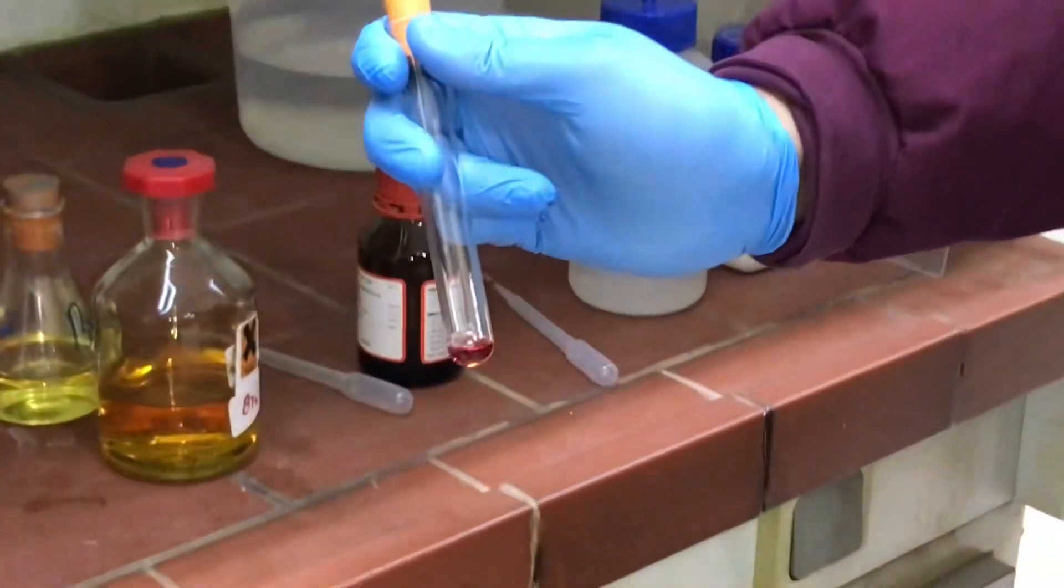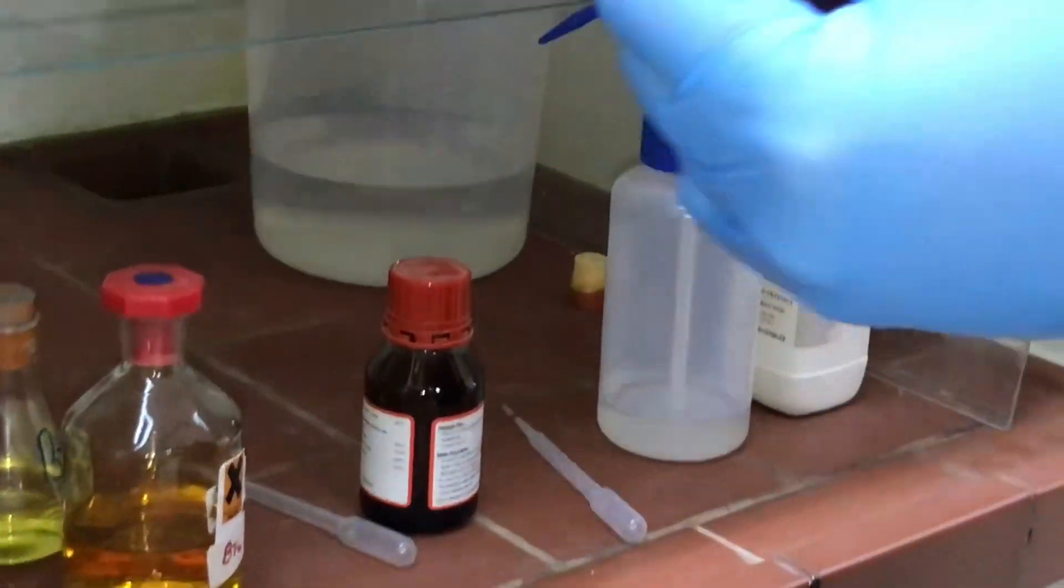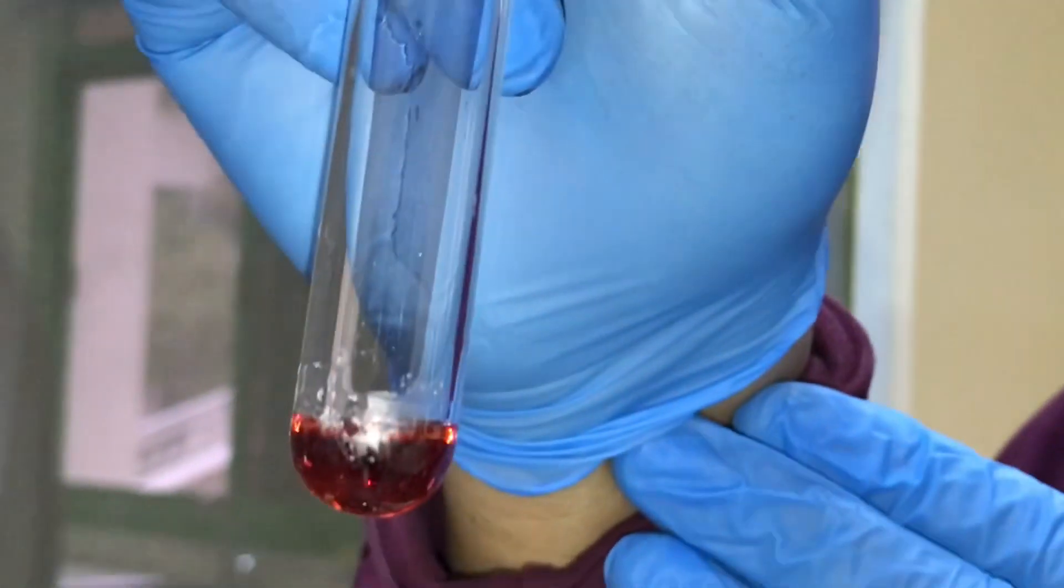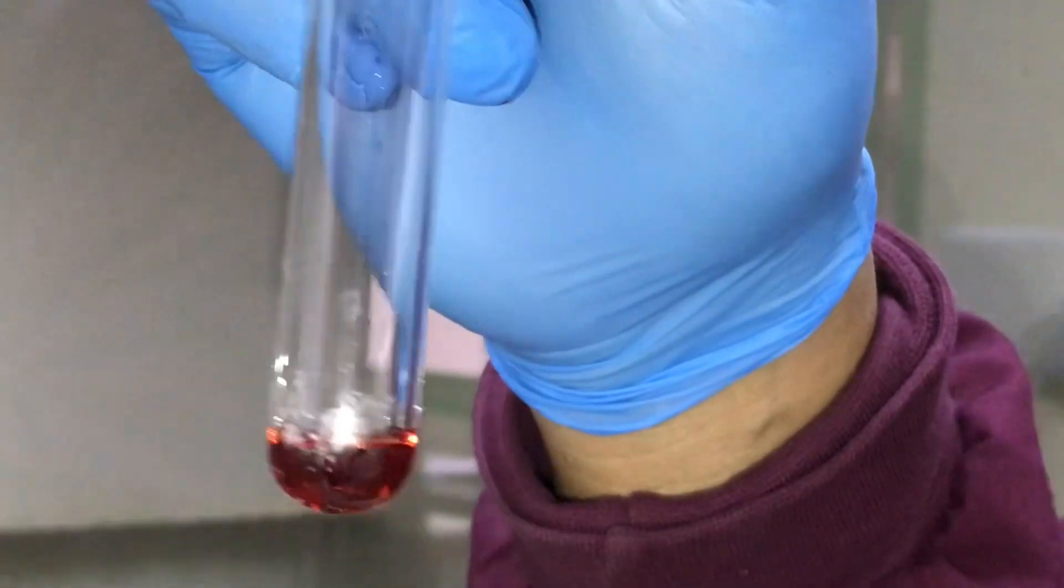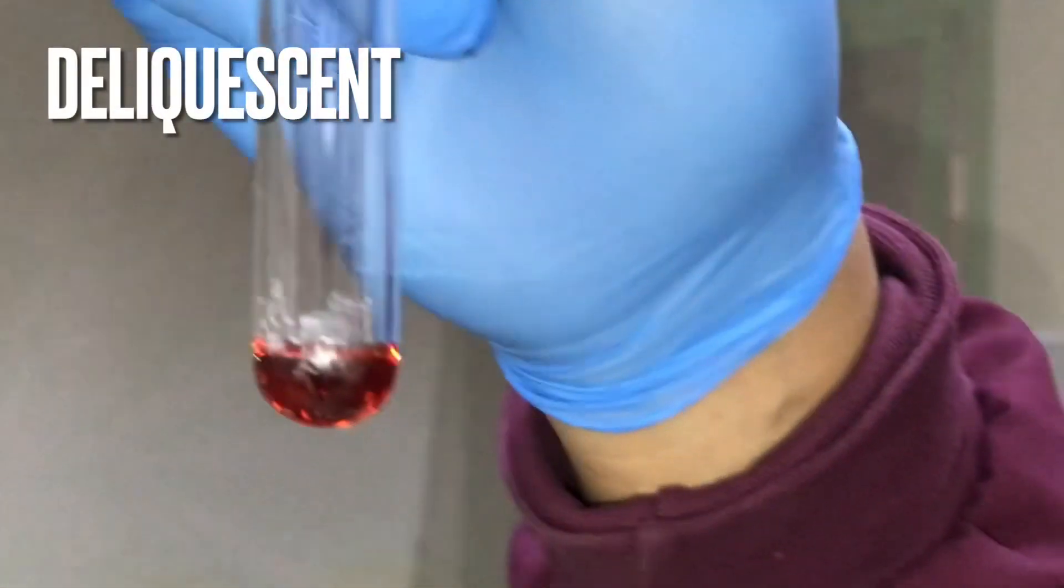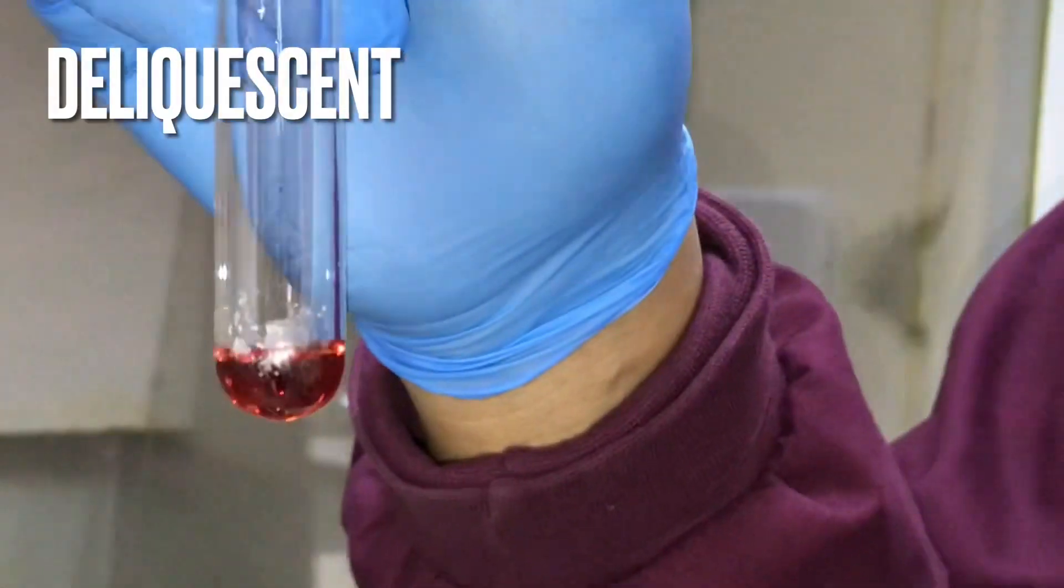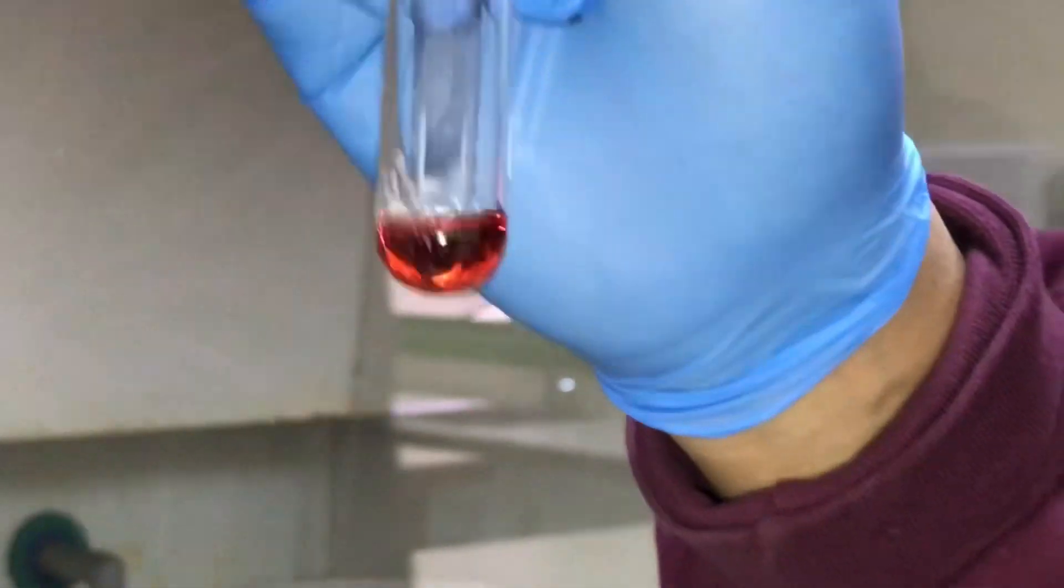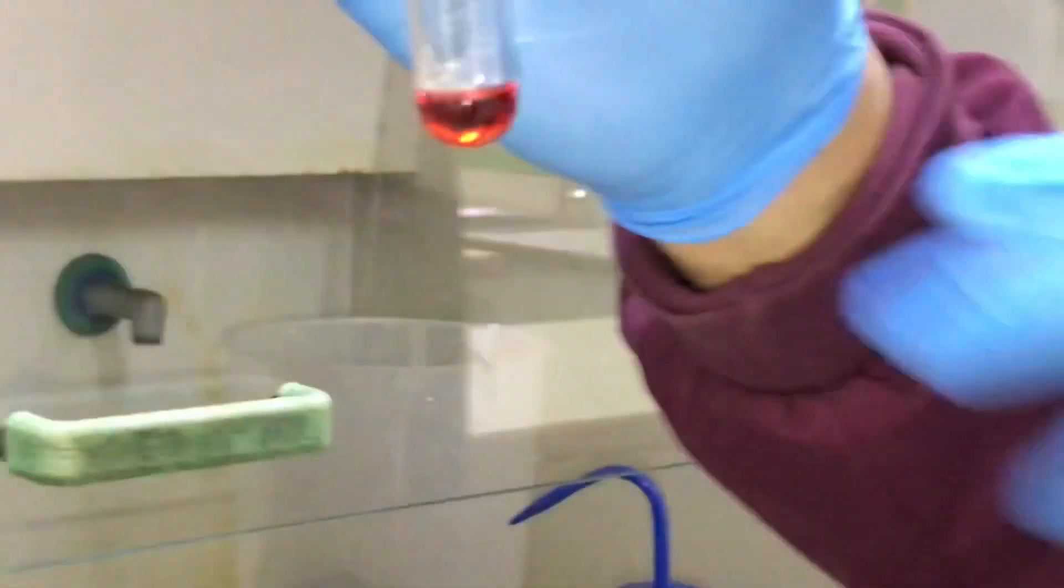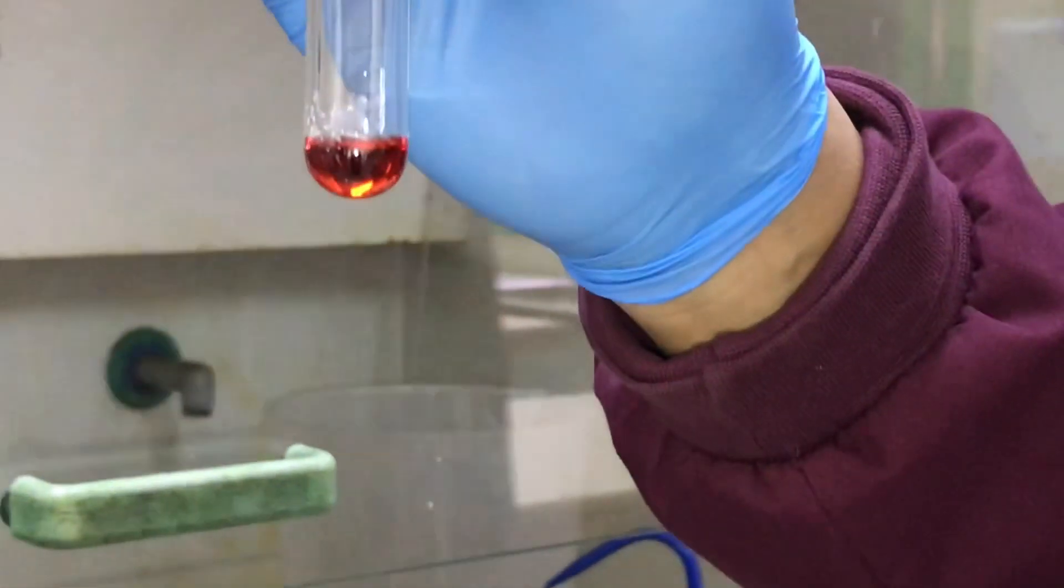We call it hygroscopic and also deliquescent. It's hygroscopic because it absorbs water from the atmosphere, but it's deliquescent because it turns into a liquid once it does that. This is from a saturated sample, so the concentration is about 0.8 moles per decimeter cubed.